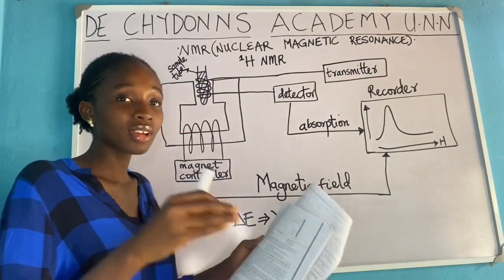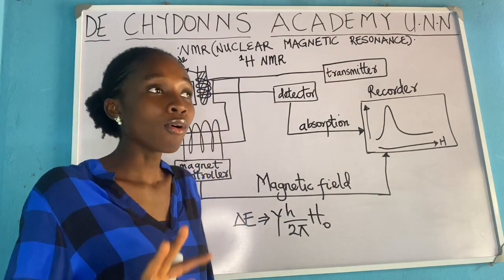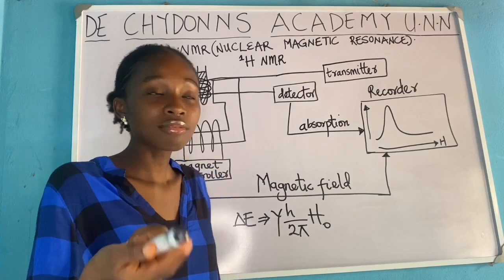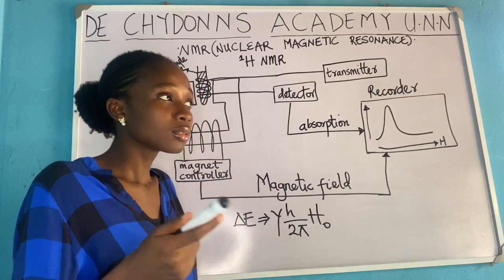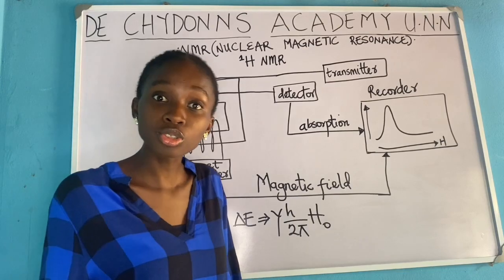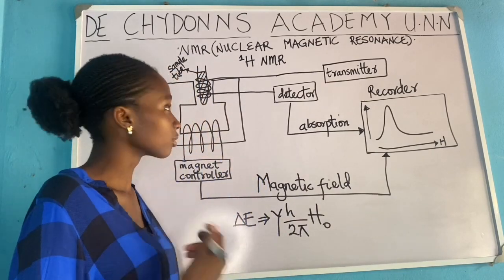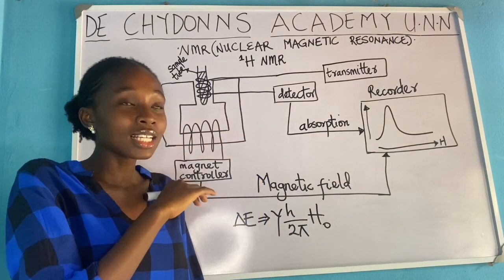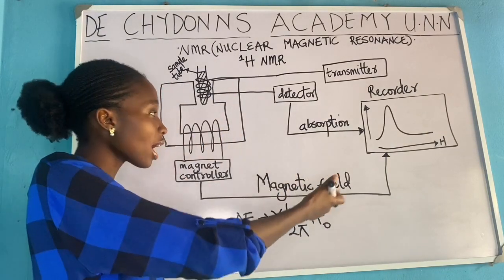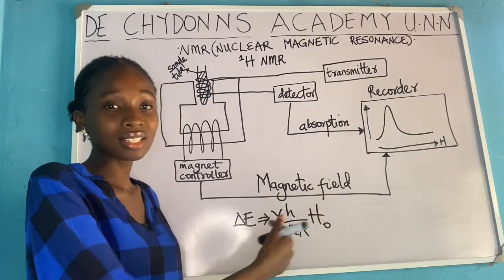Now what happens over here is that the sample is inside this tube, your unknown sample. Or as a forensic pathologist, you have a sample where somebody killed somebody and you really want to know what a particular element or substance is. You want to know the structure and you've tried everything and it's not working. You can bring this to the NMR machine. You put it in here, and then you introduce a magnetic field.